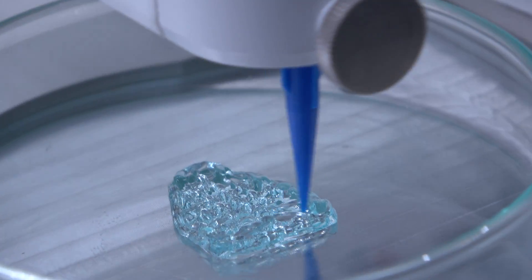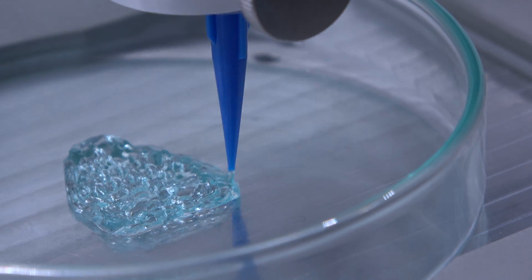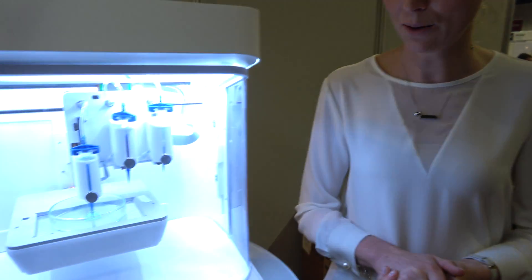When you want to print a bigger structure like this, you might want to go a little higher in printing density. This one is at 25%, but for printing a good nose I would recommend maybe 50% to get a stable structure. If you're building up to a bigger structure, you need a little bit more density.